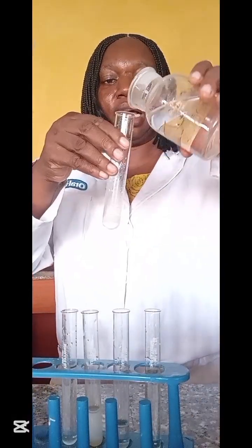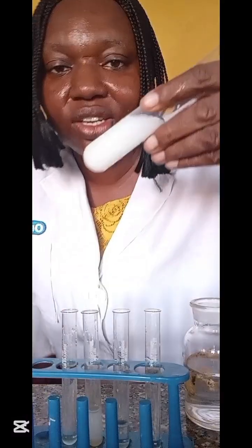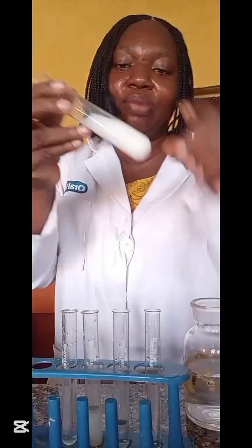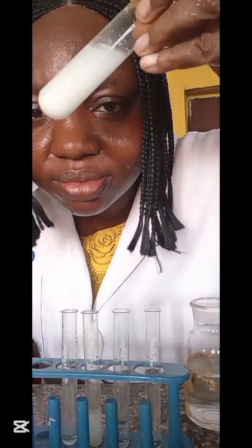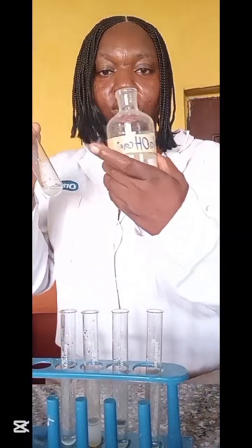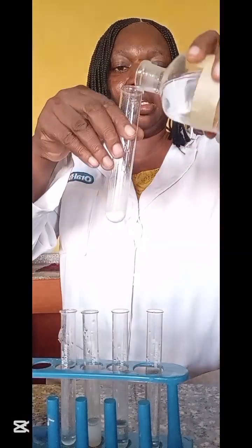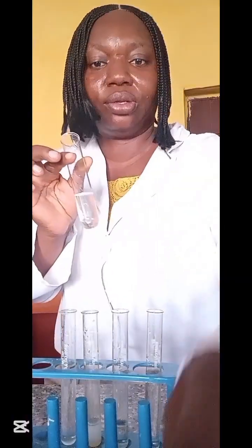So, in excess ammonia, in drops and in excess, lead salt does not dissolve in ammonia. Look at it, it does not dissolve. So let's test that lead using sodium hydroxide. In drops, still a white chalky precipitate. In excess, can you see? It dissolves. So that is lead 2 ion.